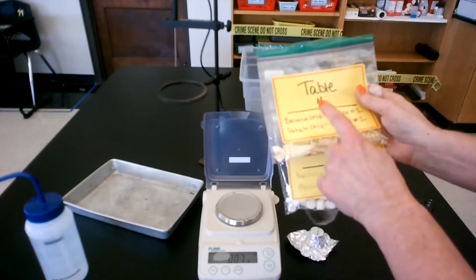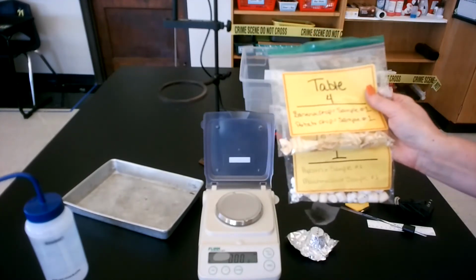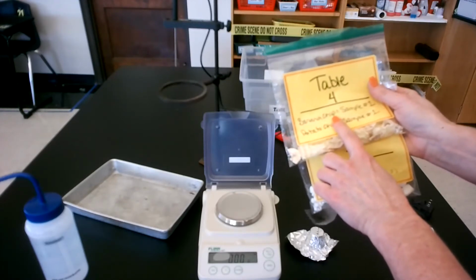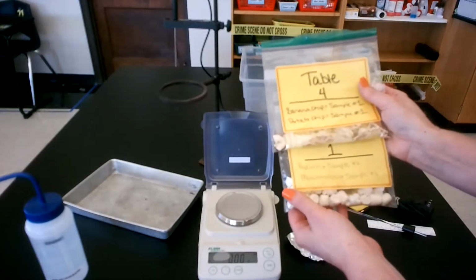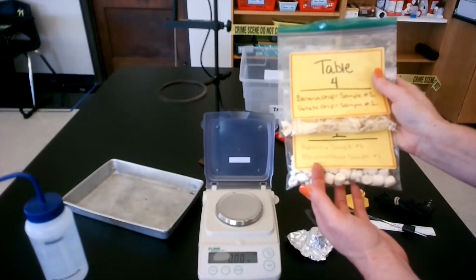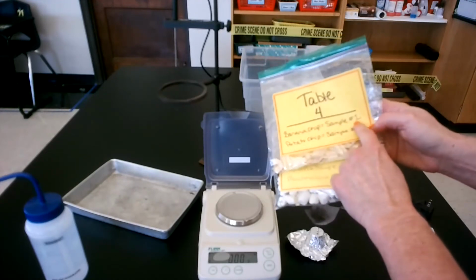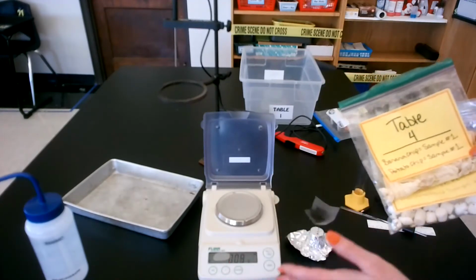Okay? So I want to pay attention to that, because we are going to do class data, and eventually for each sample, so banana chip, we're going to have three samples that we're going to find the average for our calculations. So instead of running 12 tests, we're going to divide and conquer so we can get enough data. So we'll have 4 different foods, 3 samples for each food. When we share the data, pay attention in the table to what food it is, what table it is, and which sample it is. So look at the columns very carefully, and make sure you record the numbers in the correct spaces.